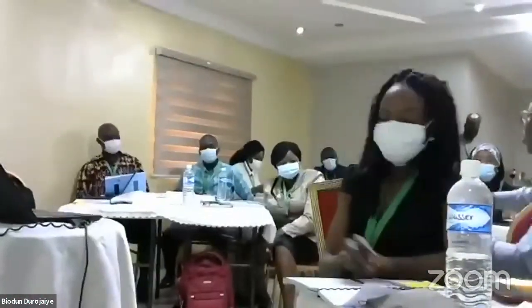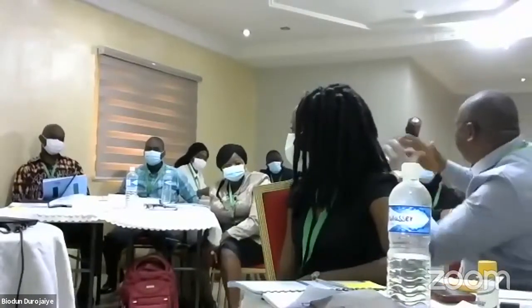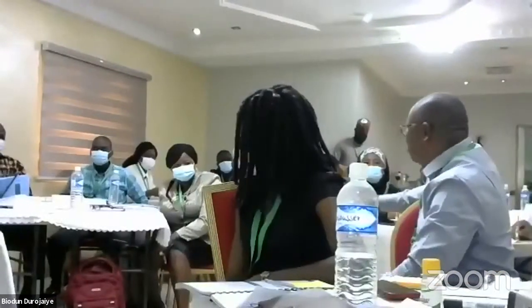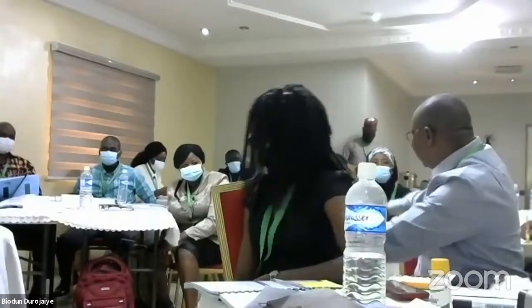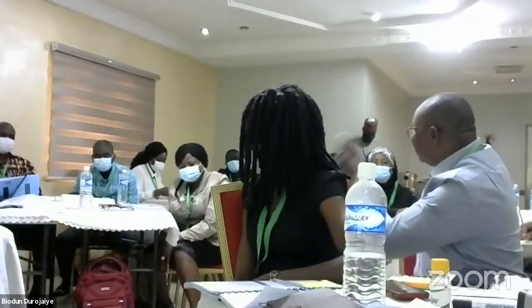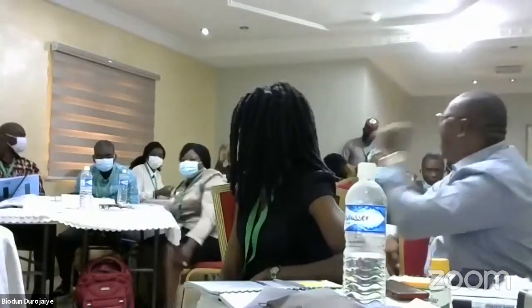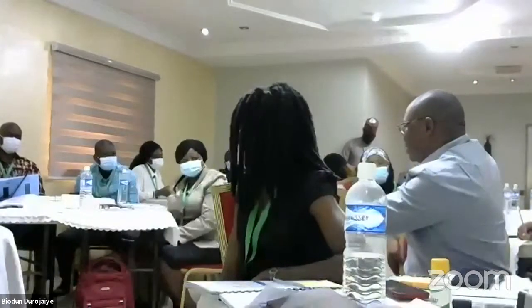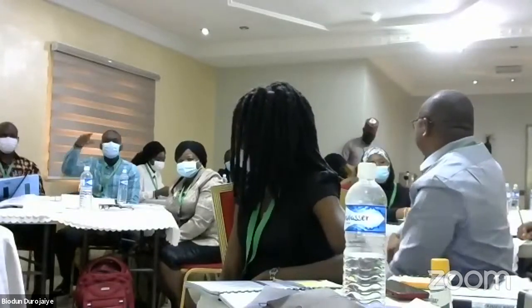Control. That's right. And so at the point of getting the job done, you compare to the control. In fact, for every machine in the laboratory, either automated or non-automated, there should be a control. Whether you run the control or not is a different thing. So the moment the control passes and you follow the SOP diligently and you have a result, then there is no need for external validation. If you are not talking of quality assurance, you don't need to take that process out of the operation.